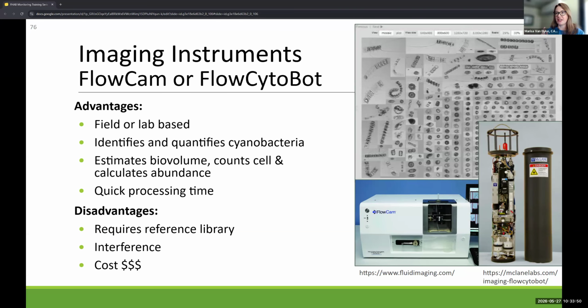So that flow cytometer is used to detect the cyanobacteria versus other phytoplankton by taking small amounts of the water sample, letting it drop through and taking images of it. It compares the image of what it's capturing in each droplet to a library of images to determine what family or genus that organism belongs to. So you're going to know about your cyanobacteria, your algae, your diatoms, and so forth. From what we understand, in about 6 minutes you can run an entire sample, unattended.